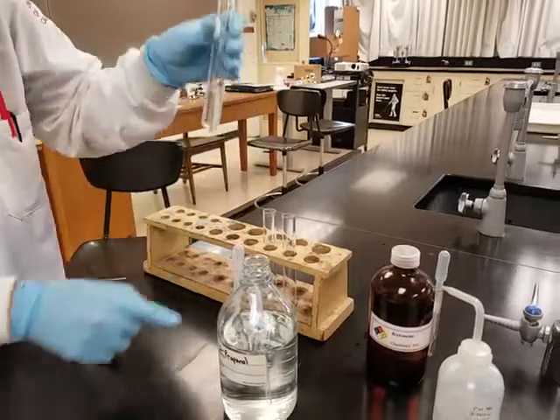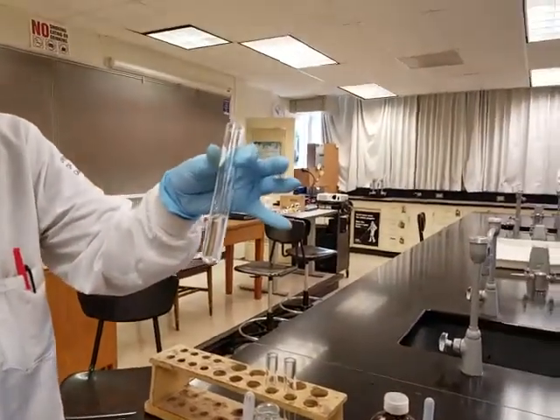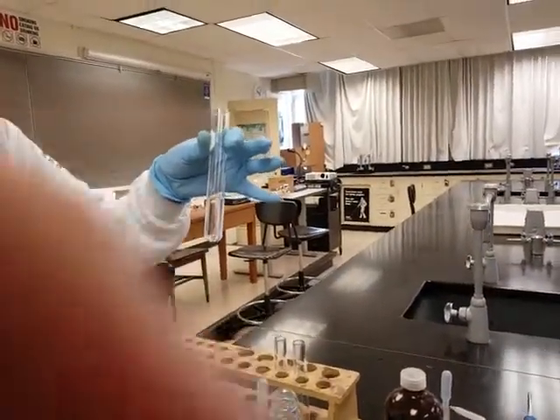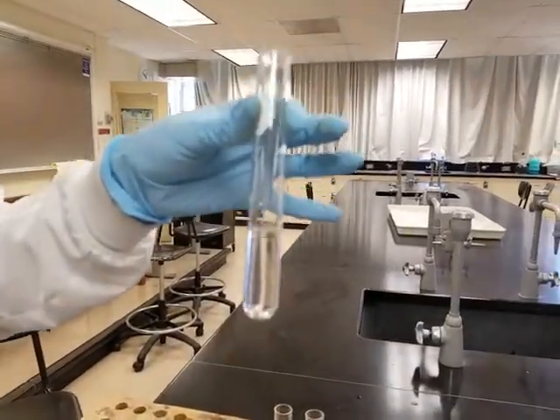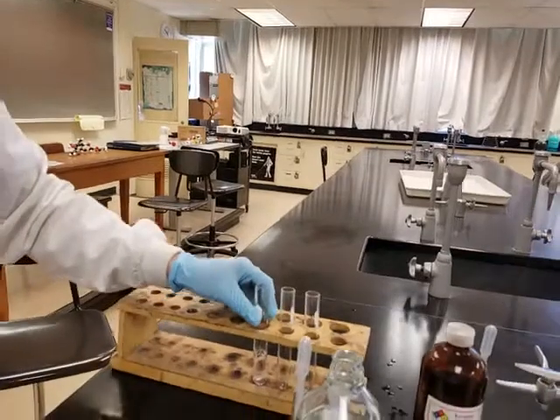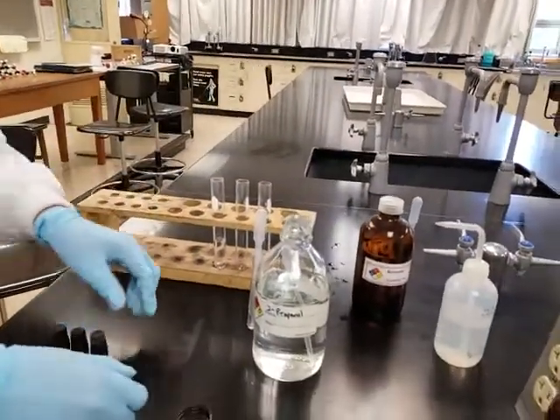I'm going to show you what it looks like before the shaking. Take a look at that. Can you see it? All right, so that was DI water and isopropyl alcohol.